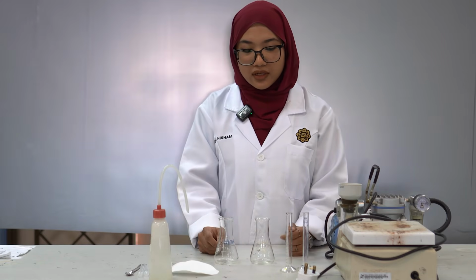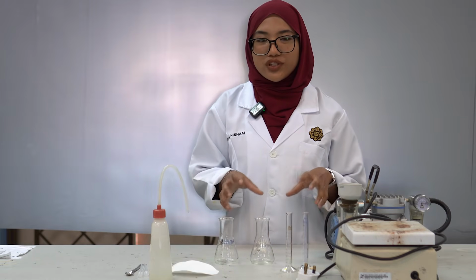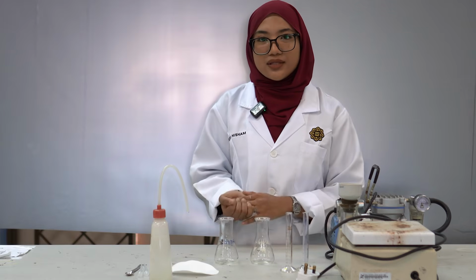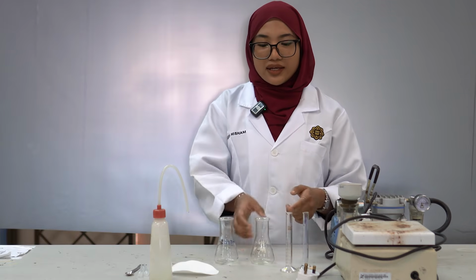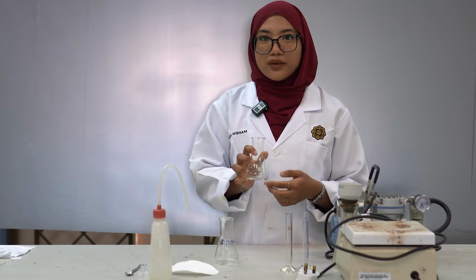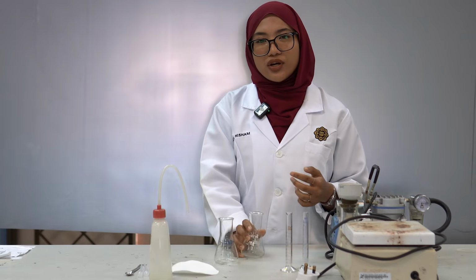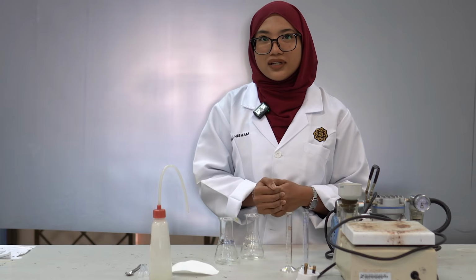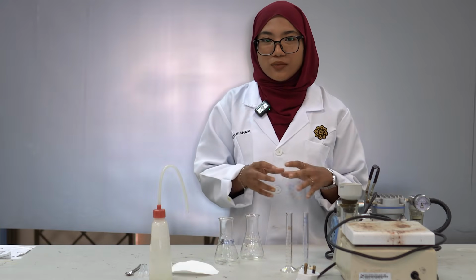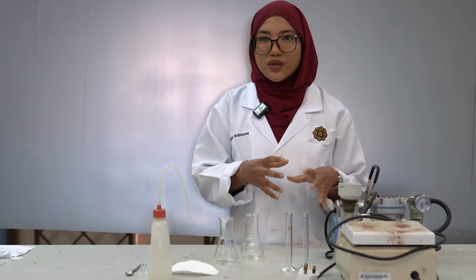Alright, so as we can see, there are two different crystal forms, and as Sister Husna said, the one from the mixture solvent that was cooled by the ice bath is formed less aligned and not as beautiful, because the molecules have no time to arrange themselves, and it is a bit disordered.